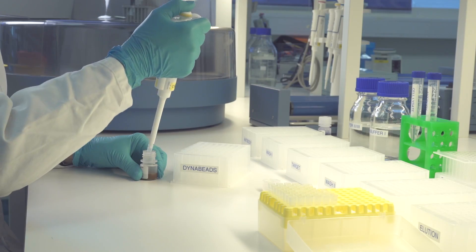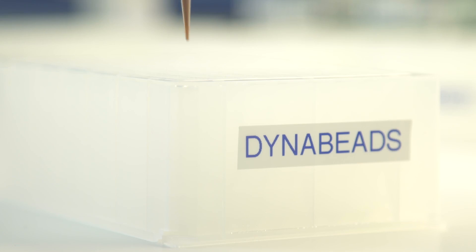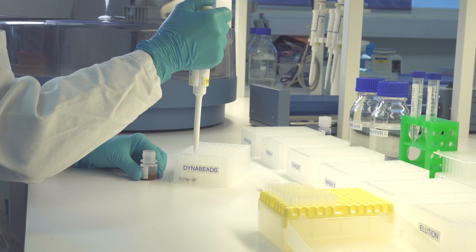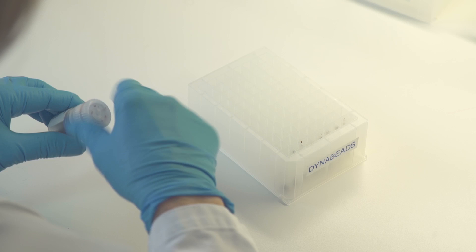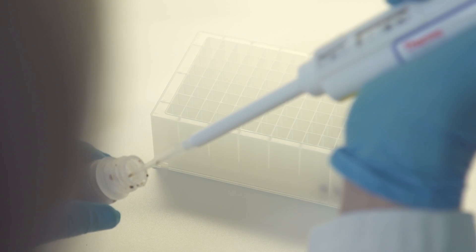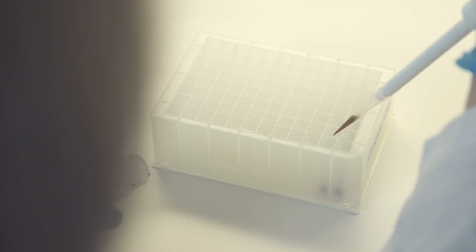The first plate is prepared by transferring 50 microliters of resuspended DynaBeads to each well. When performing many IPs simultaneously using several rows on the plate, make sure to mix the vial of DynaBeads between transfers to each row to ensure an even amount of beads is loaded to each well.